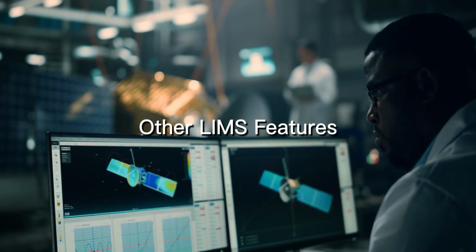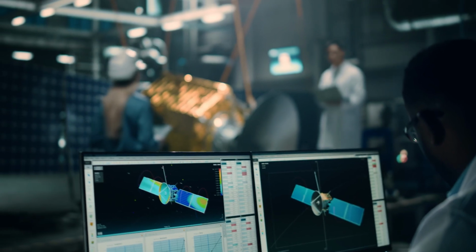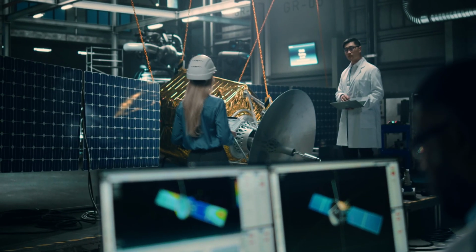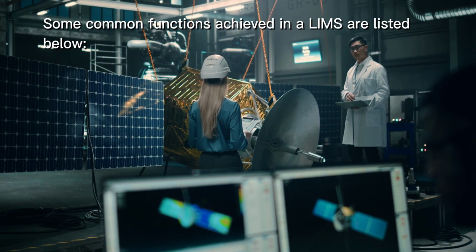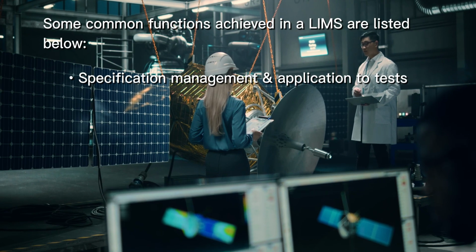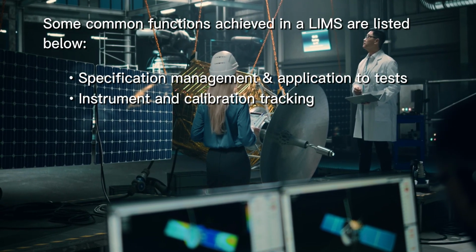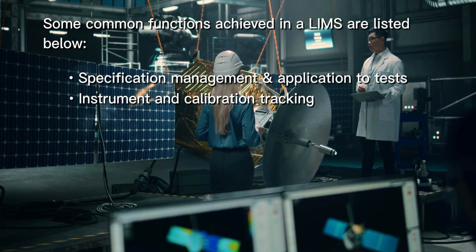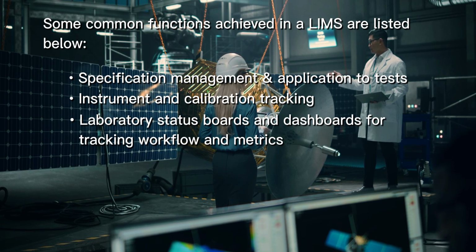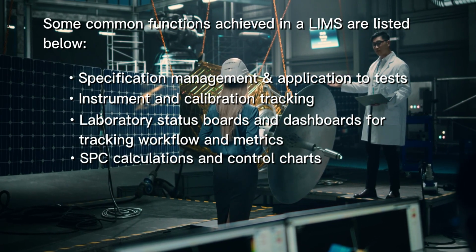Other LIMS features. Every laboratory has different requirements for their processes and workflows, and each LIMS provider addresses those requirements differently. Some common functions achieved in a LIMS are listed below. Specification management and application to tests. Instrument and calibration tracking. Laboratory status boards and dashboards for tracking workflow and metrics. SPC calculations and control charts.